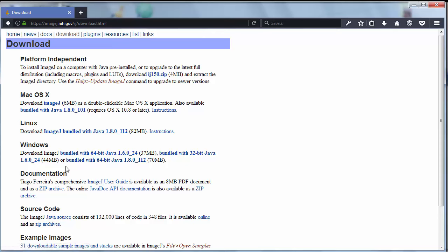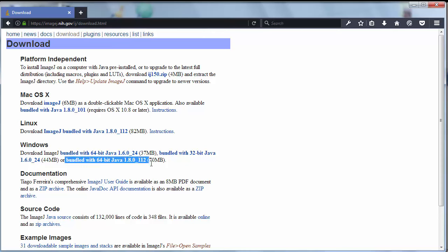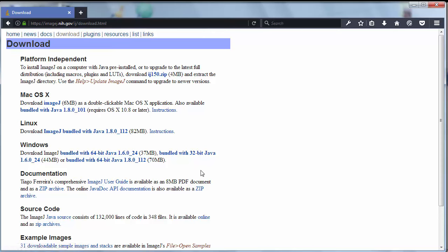The latest and most stable version is bundled with 64-bit Java version 8, but I'm gonna download this bundled with 32-bit Java version 6.